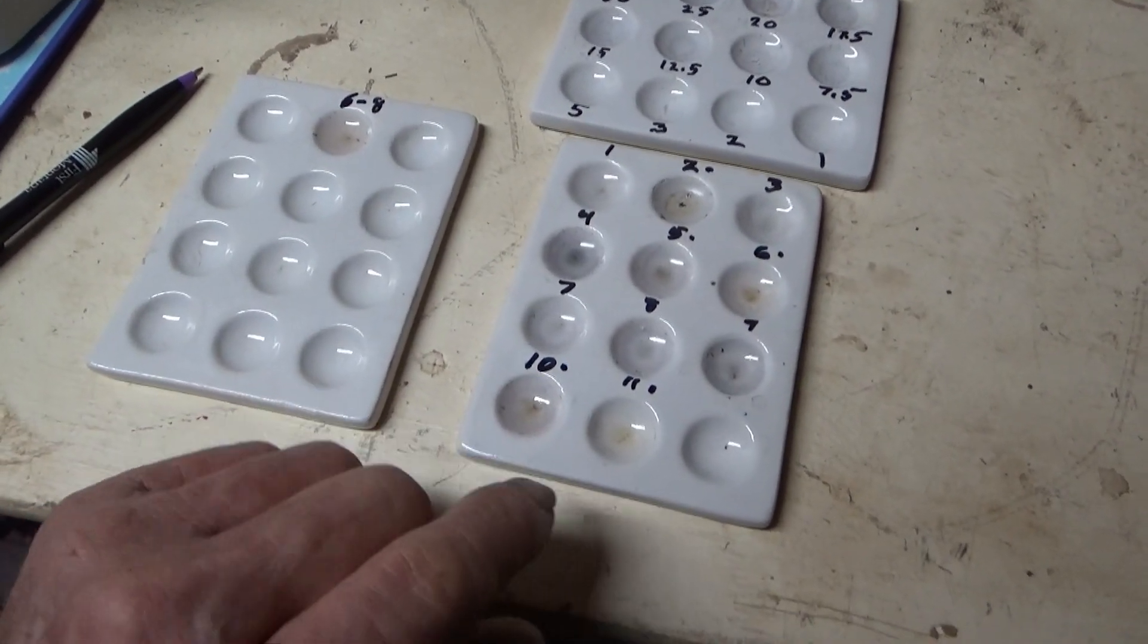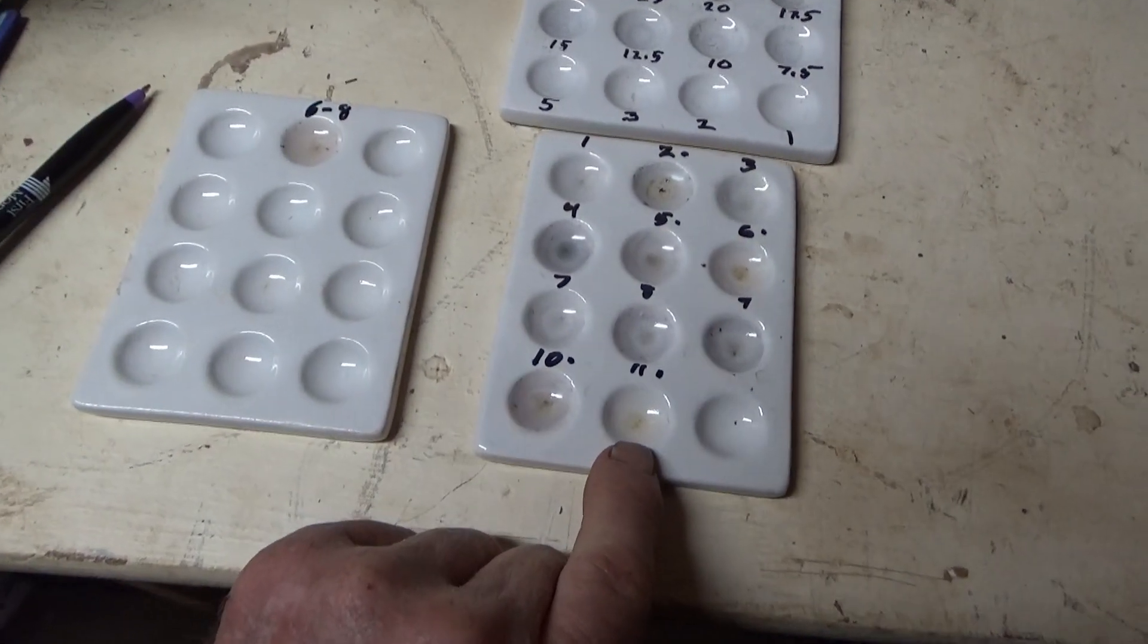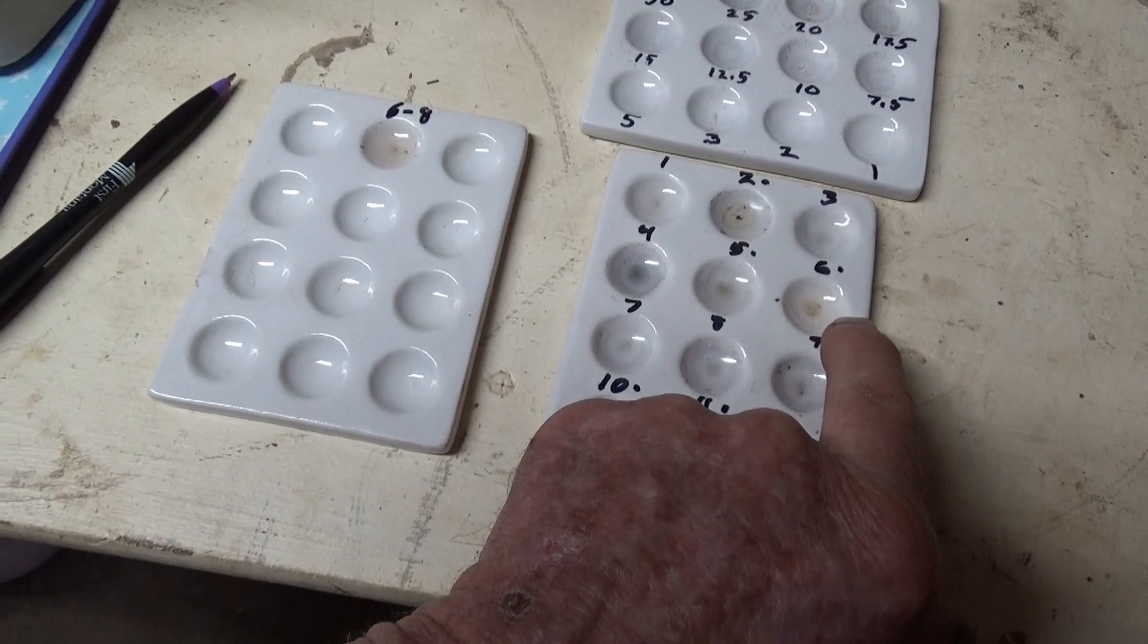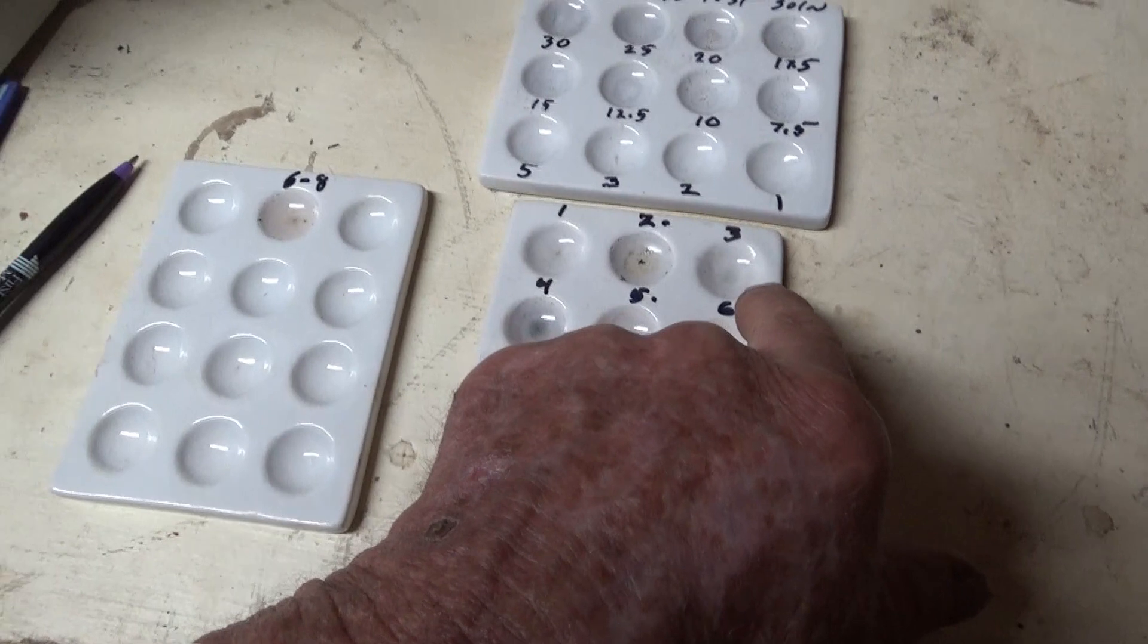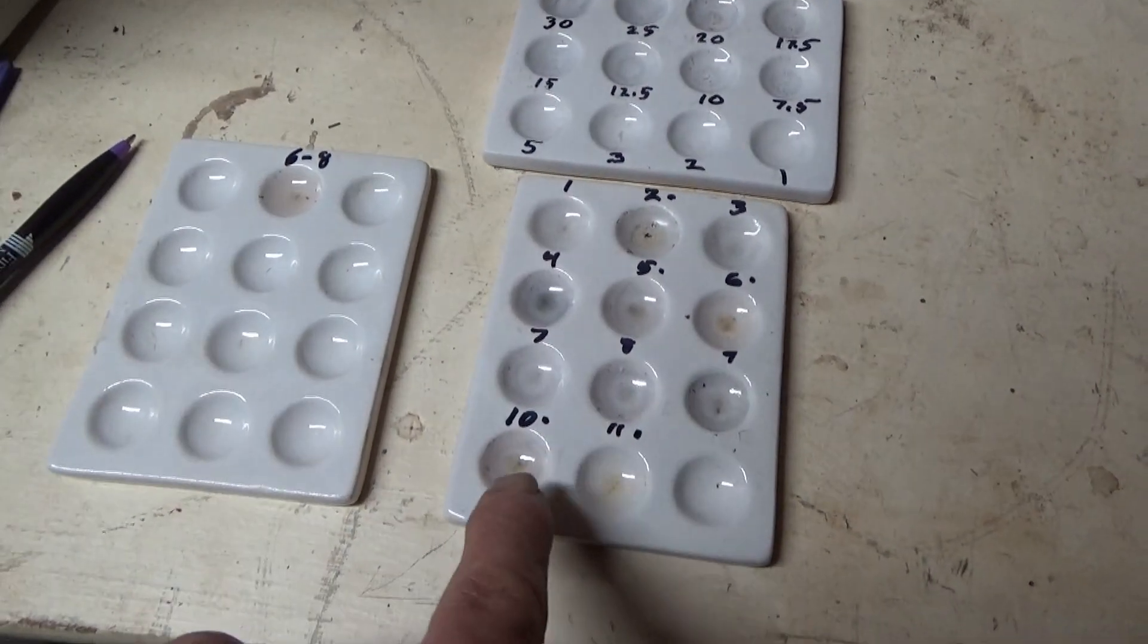For our purposes we can see here that's 0.02, 0.2 parts per million. Six is 3.14 parts per million. This one here, three is 3.8 parts per million.